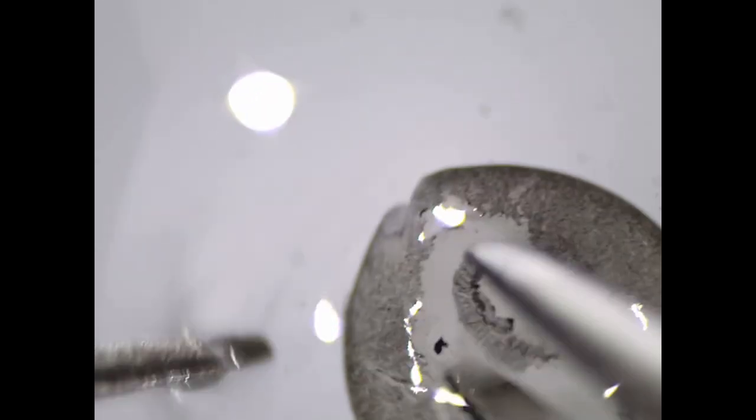Remove the lens, the vitreous humor, which appears as a jelly-like structure, and the hyaloid vessels together. Sometimes the hyaloid vessels are left on the retina, so remove them carefully by avoiding scratching the retina surface.